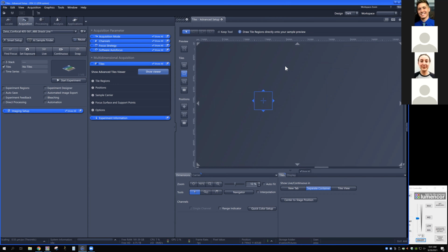We've changed the way that we do the button interface quite a bit. At the moment, what we've done is to basically arrange all of the tools that you need along the left-hand side. This eliminated a whole series of tabs that we had along the bottom that were a little bit cumbersome to navigate and didn't make it easy to access along with these other tools that you need. So in essence, what we have is a list of different options along the left-hand side, and depending on which option you choose, that activates along the top the tools that you're really going to use.